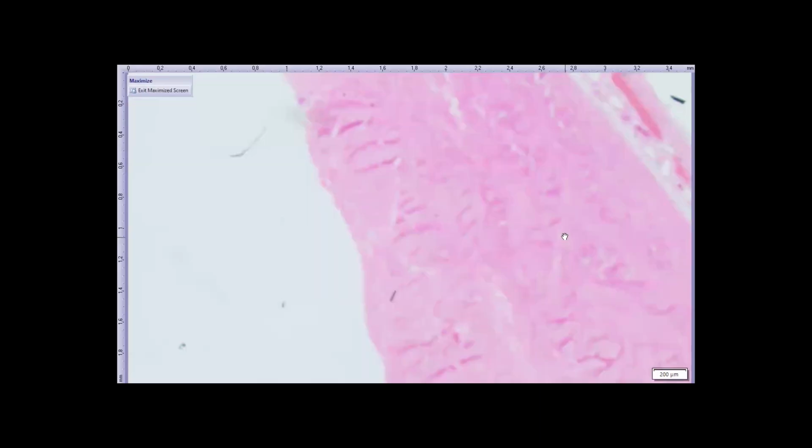Oh yeah, that's not the way a microscope works. I don't know if people have paid attention to how I was showing those very low magnification images.